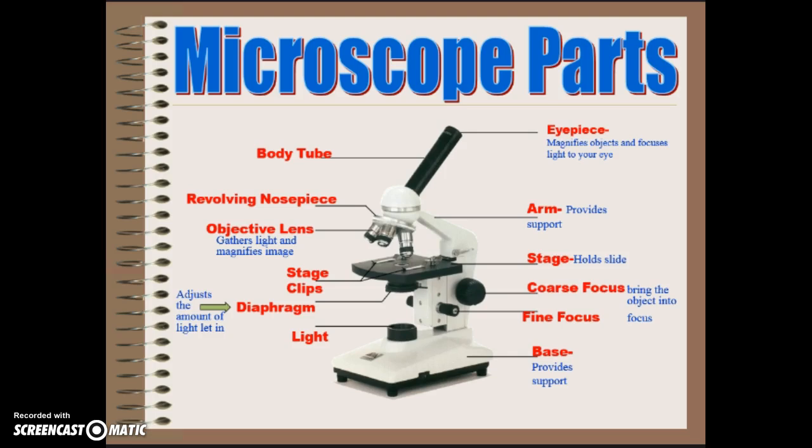Students, these are the parts of the microscope. Make sure you have your image filled out as well.